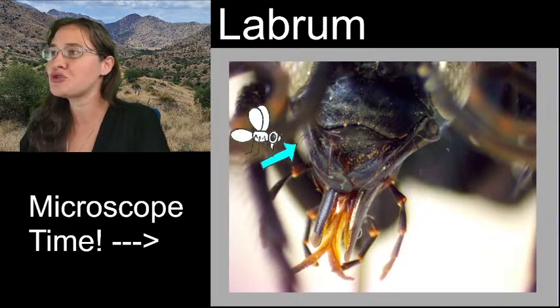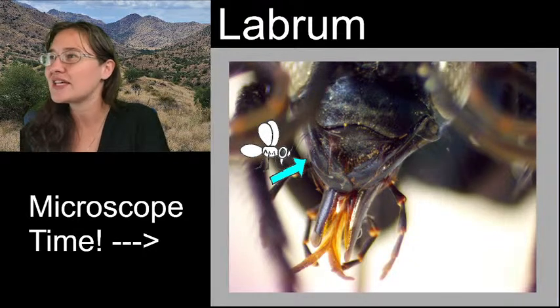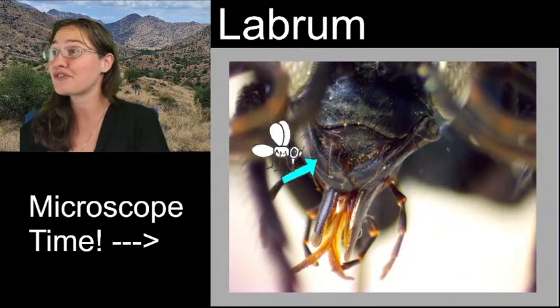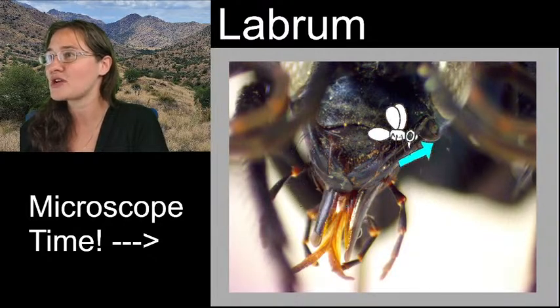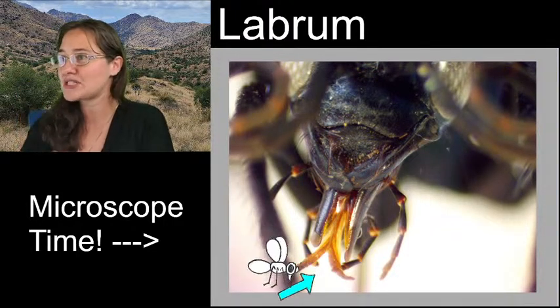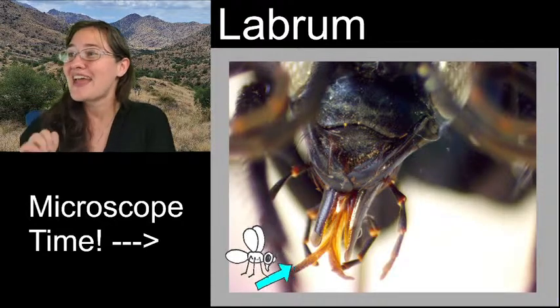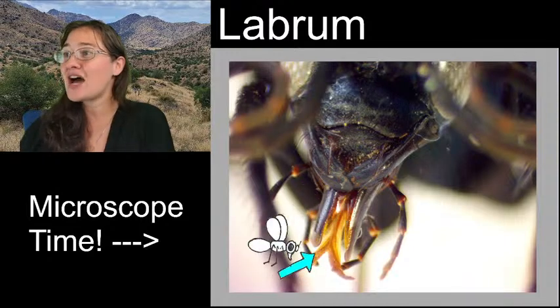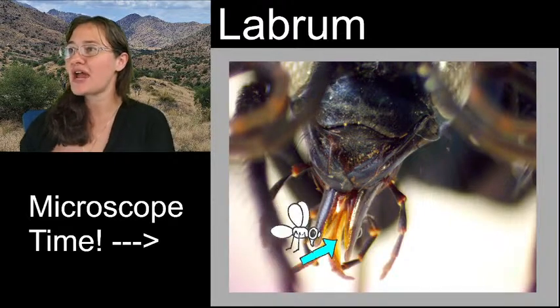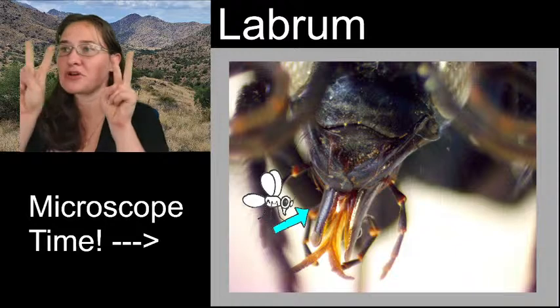Then you have two mandibles up here in the front. These are used for chewing. So chewing pollen, that's a powder, that's a solid. I don't know what else these guys would really chew on, unless they found something really sweet, like a fruit. They could chew on a fruit. But here, this is a mandible that ends right about here, and there's another mandible that comes over this way. And then I mentioned it was lapping, right? So it's not a straw. It's not actually drinking its food. It just sticks this forked-like tongue down into yummy sugary goodness, and it will lap up food that way. That tongue does have the ability to hide between these two darker pieces here and there. Those two pieces are along the edges of that tongue-like mouth part, and that's like its protective sheath.